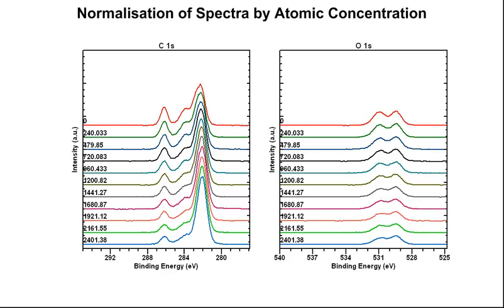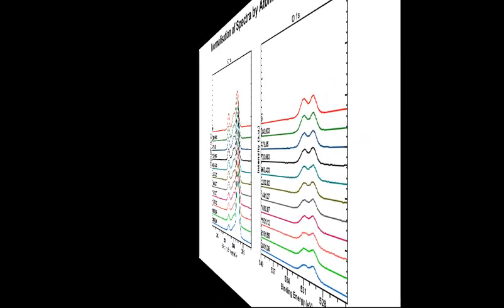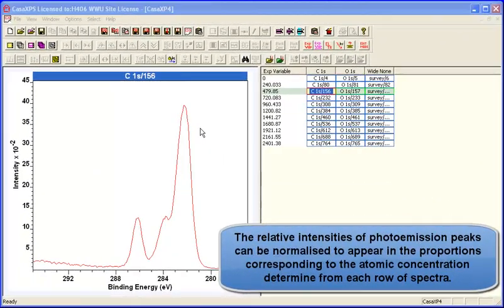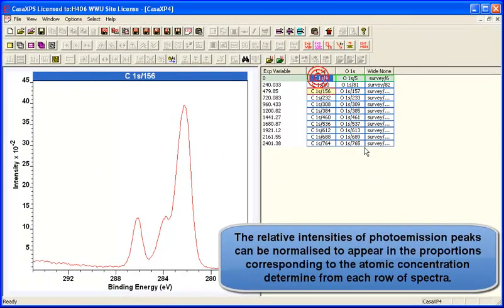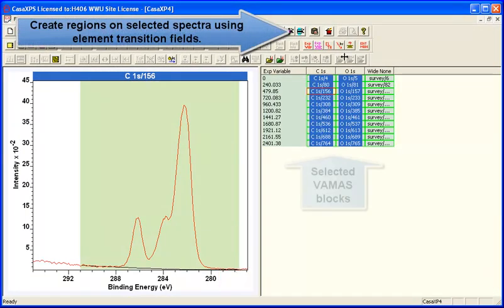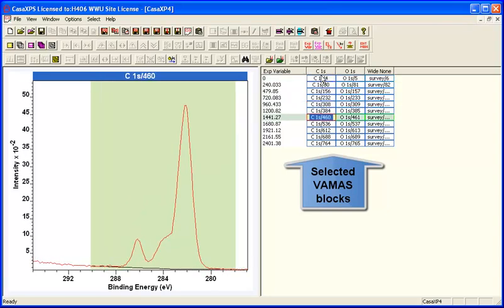It is common practice to normalize XPS spectra and present it as an atomic concentration table. However, you can also present the spectra themselves in terms of a normalization based on the atomic concentration.